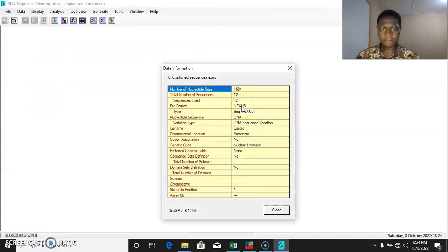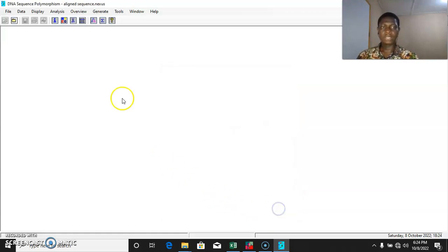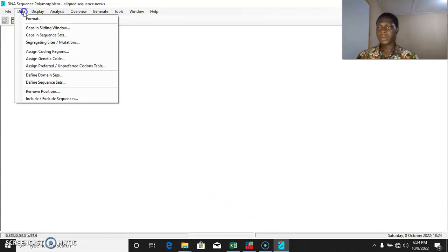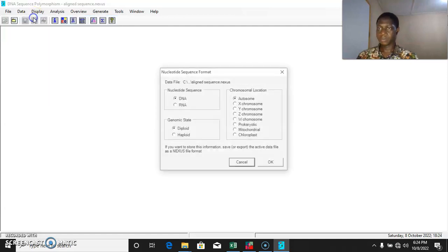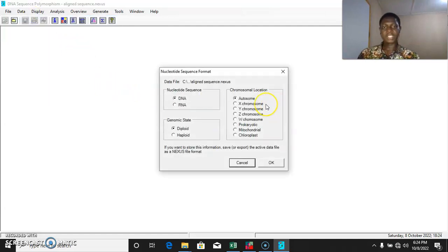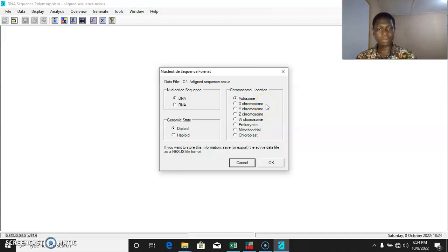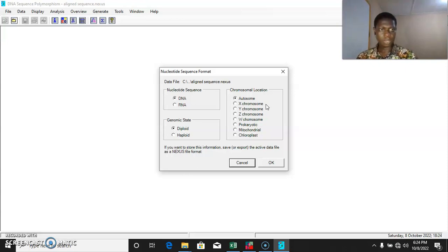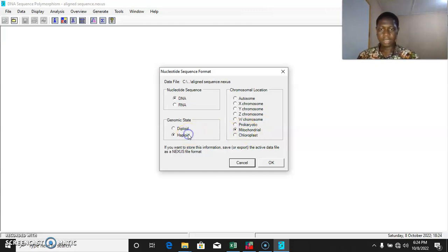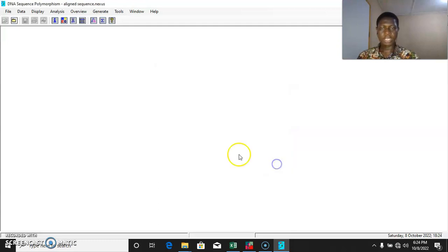This is generalized information about our sequence. Then we close the data, come to Data, select Format. The basic information about our data is our sequence. The sequence we are using as an example is a mitochondrial cytochrome oxidase subunit 1 sequence. The sequence is in the mitochondrial part and it's haploid. So select Mitochondrial, Haploid, and OK.